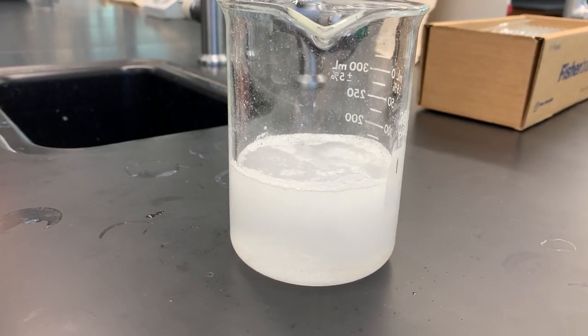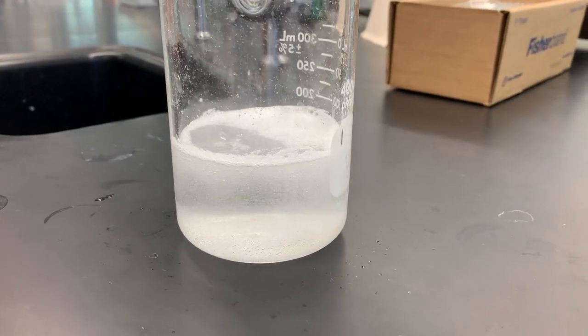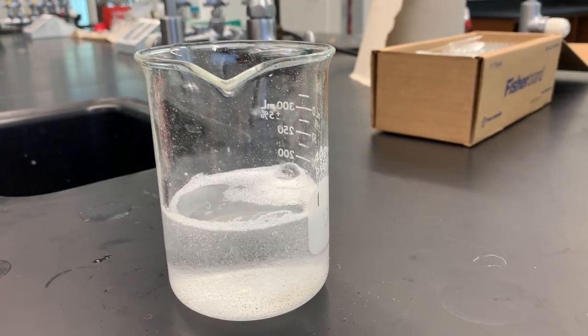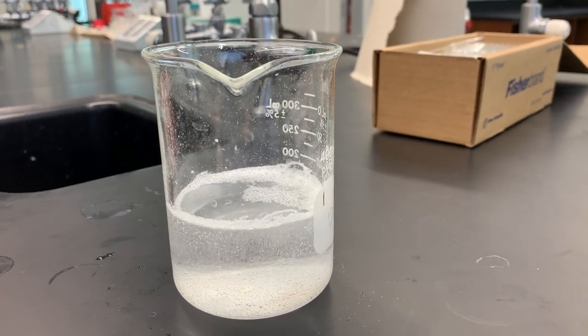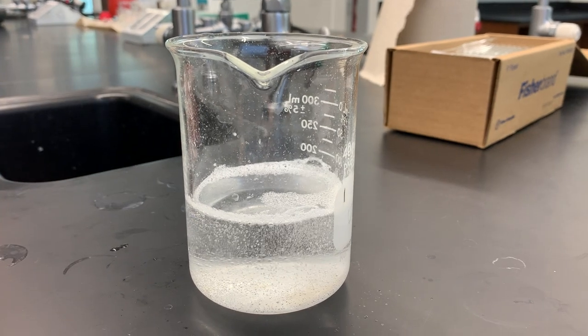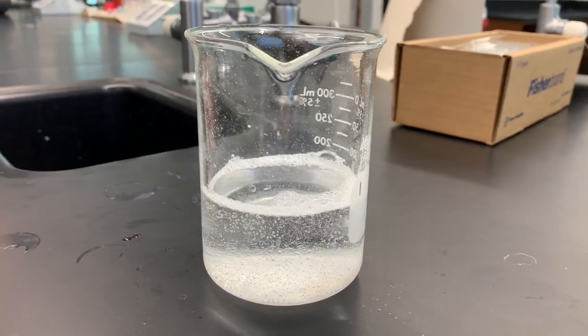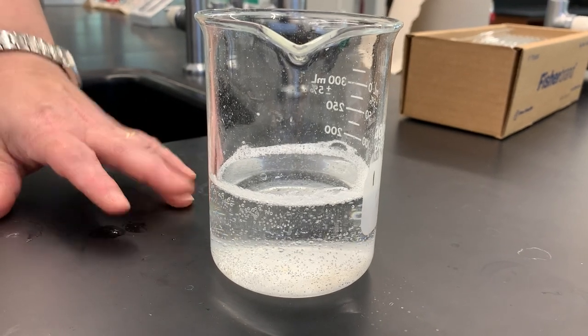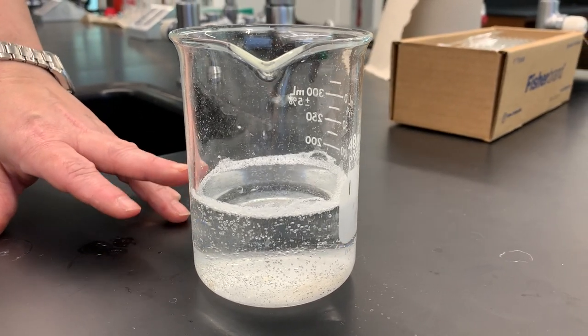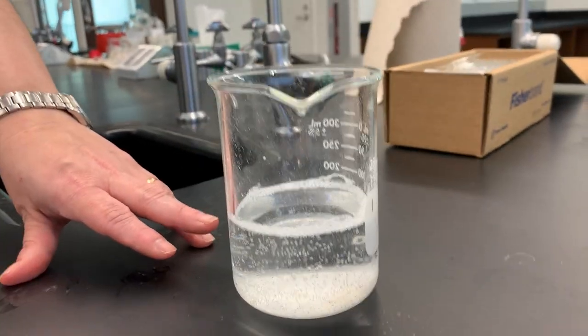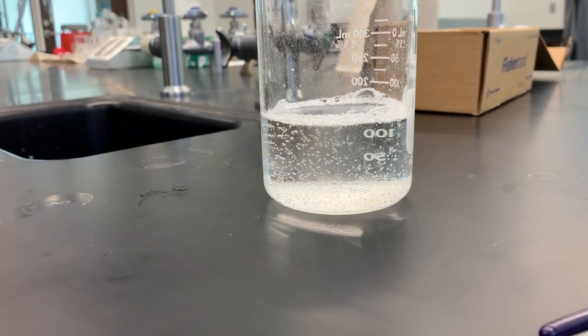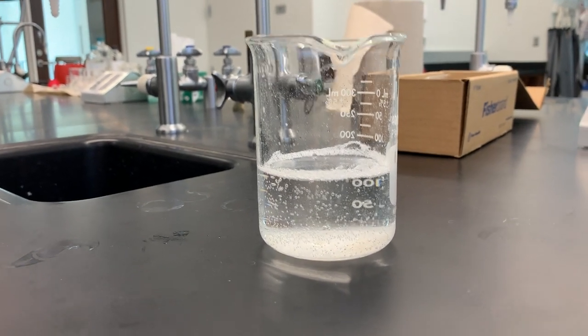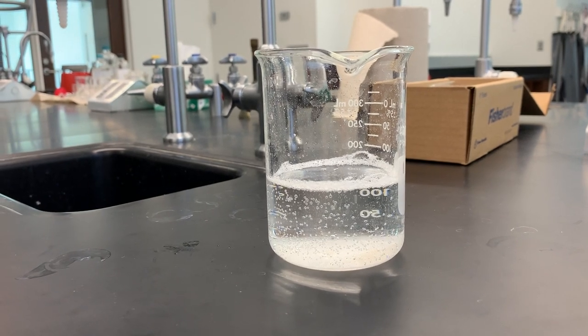So, how come tablet is bubbling like this? Well, you probably could guess that the bubbles that you see here are those of carbon dioxide. But why is CO2 being produced with just water? Doesn't it need acid? And the answer is, yes, it does. Sodium bicarbonate, regular baking soda will never bubble if you just add water to it. So, how come it bubbles here? Well, we have to look at other ingredients in the tablet. I told you one ingredient is aspirin. But aspirin, although slightly acidic, is not acidic enough to cause all this effervescence. I mentioned the mystery ingredient before. So, I wanted to tell you that the third ingredient in a medicine like this is actually citric acid. And citric acid is only added to the tablet in order to create this bubbling or effervescent effect.